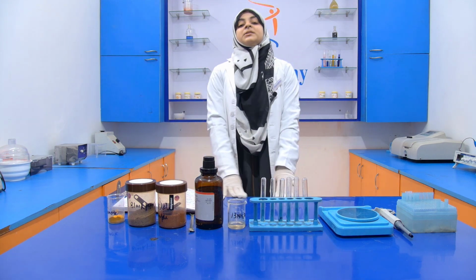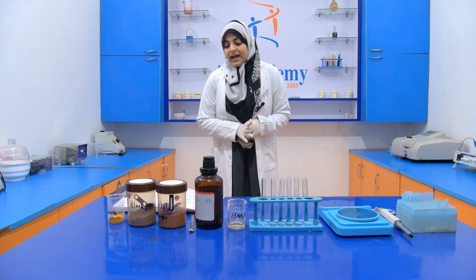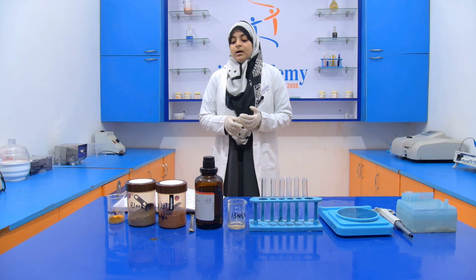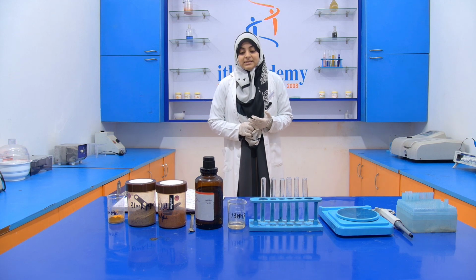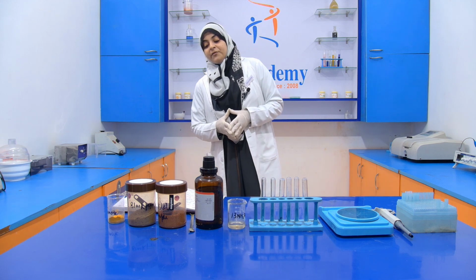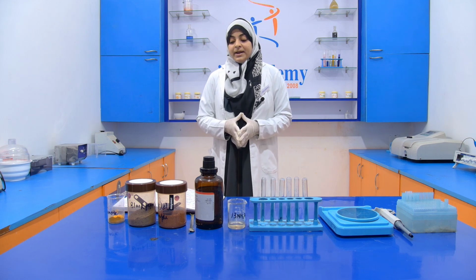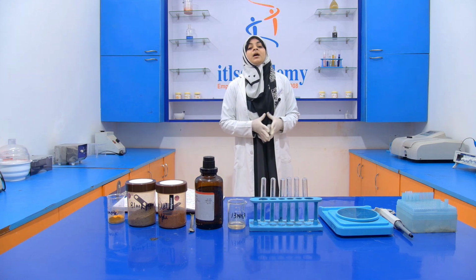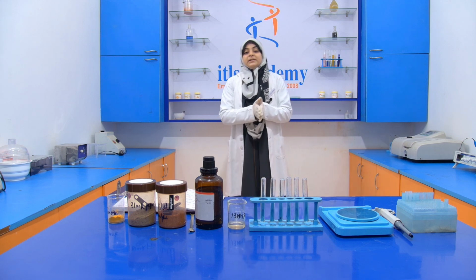Now for performing this experiment we require two chemicals. One is petroleum ether and another one is 13 normal sulfuric acid. Now for the preparation of the 13 normal sulfuric acid, we take 88 ml of sulfuric acid and dissolve it into 250 ml of distilled water. How do we calculate this value?